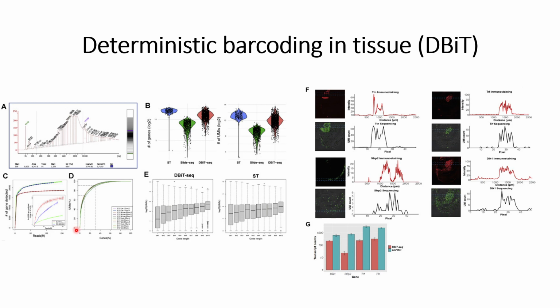Next, they did a cumulative analysis. In the cumulative analysis, they found that the top 10% of the genes cover 70% of the UMI, the unique molecular identifier. The top 30% of the genes cover 90% of the UMI, and this is the same for almost all the techniques that are being used.